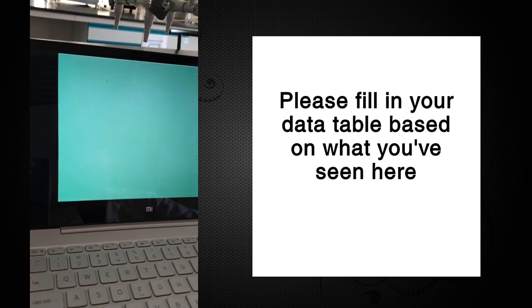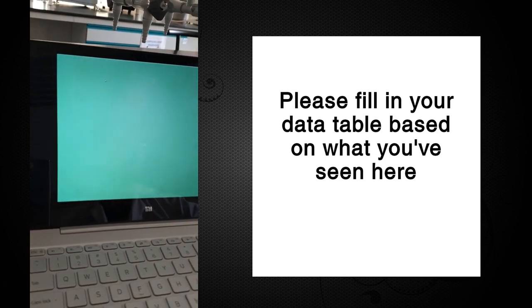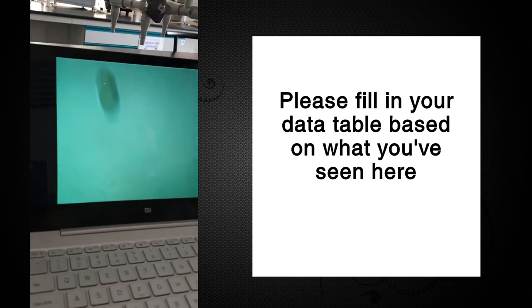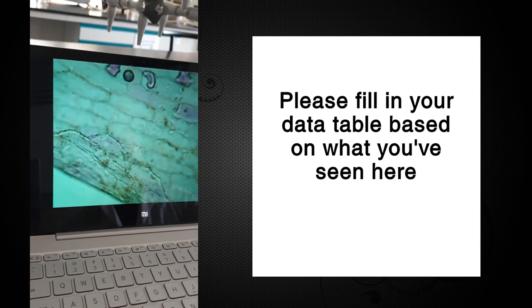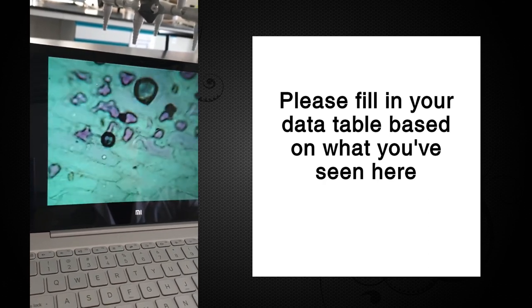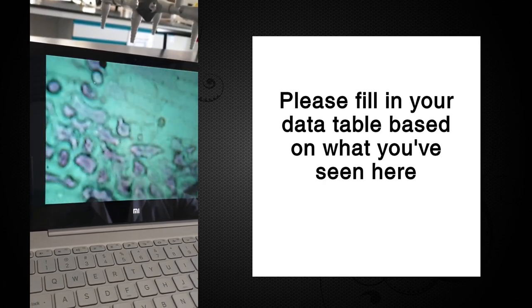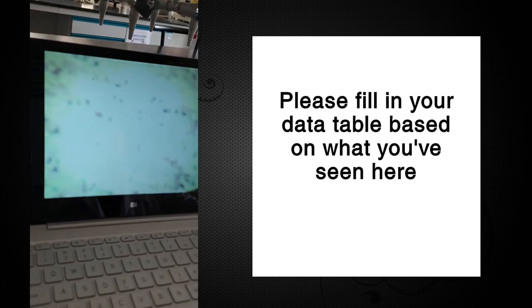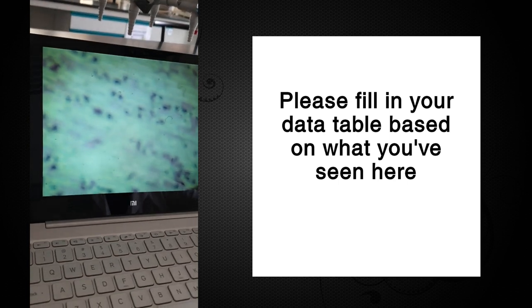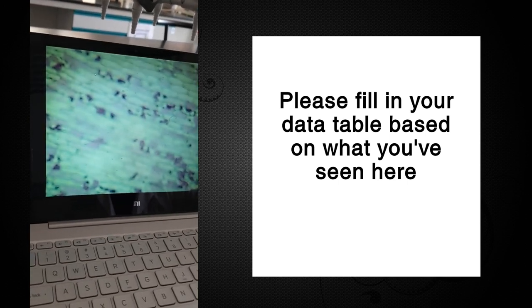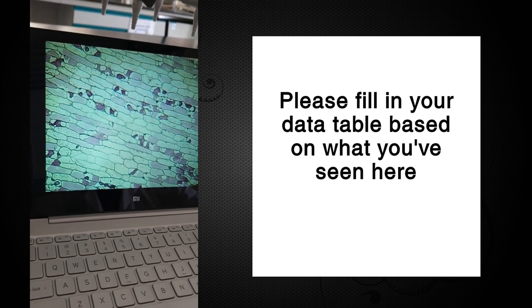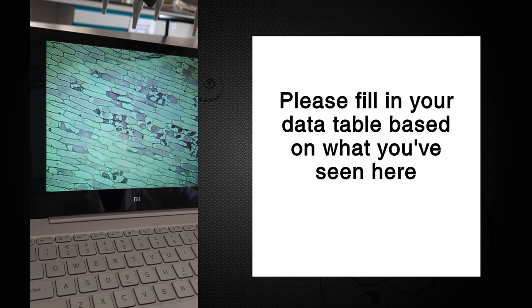Instead, we're going to go with the 10% slide, which is the hypertonic solution. And we're going to see the difference. So let me just move this over. Let's zoom out a little bit first to find an interesting area. Okay, so right away you can see there's a difference there.